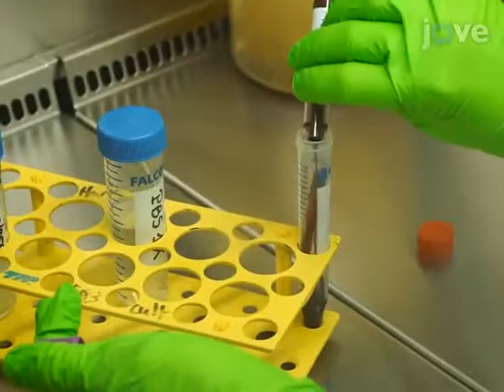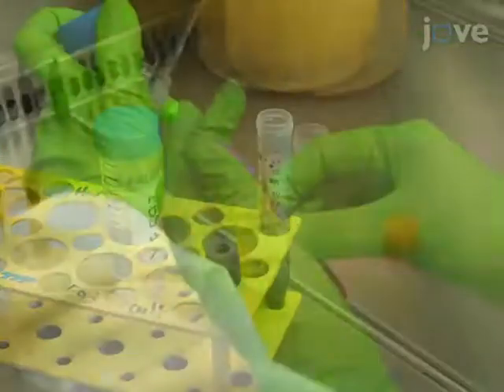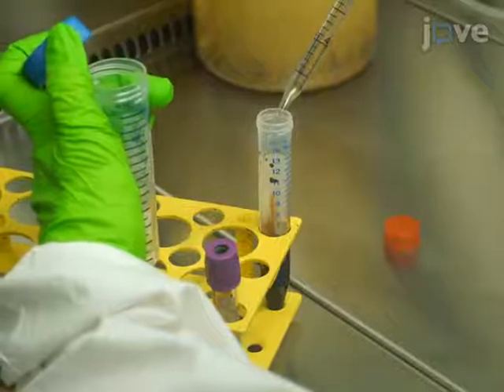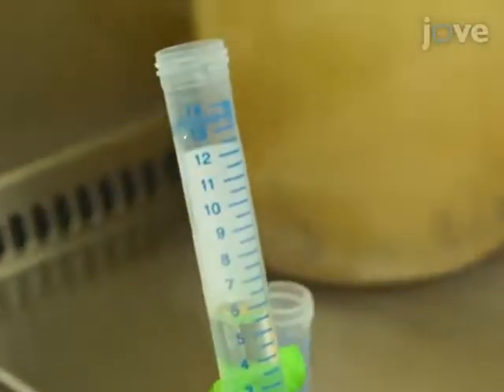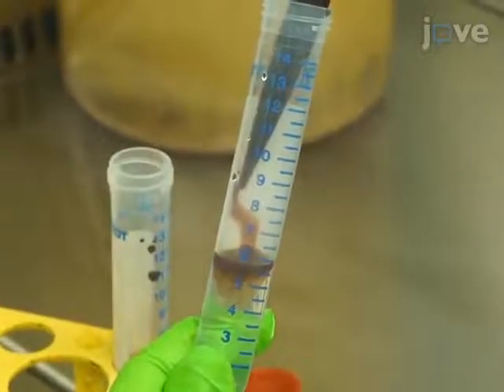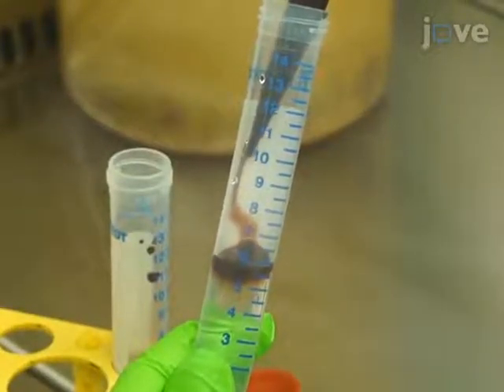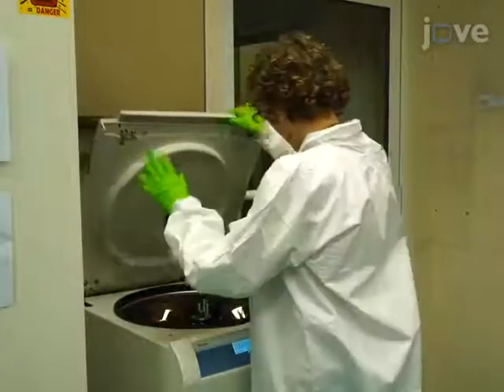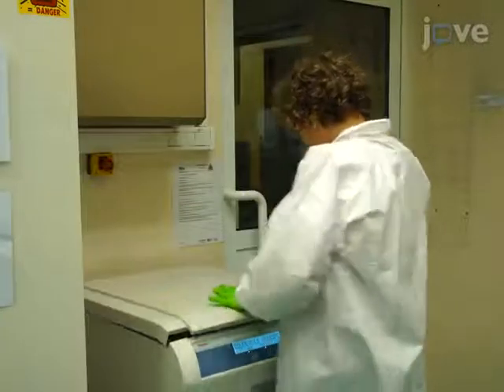Isolate mononuclear cells from red blood cells and granulocytes by first diluting bone marrow in three volumes of PBS. Then, carefully overlay one volume of FICOL with one volume of diluted bone marrow. Spin the density gradient at 300 g for 30 minutes without a break.